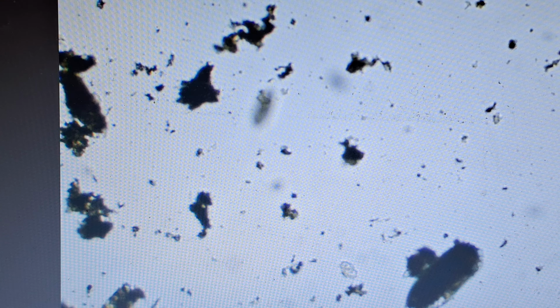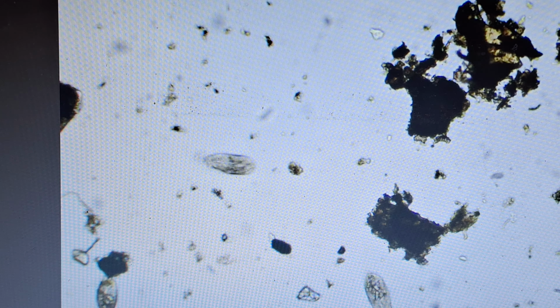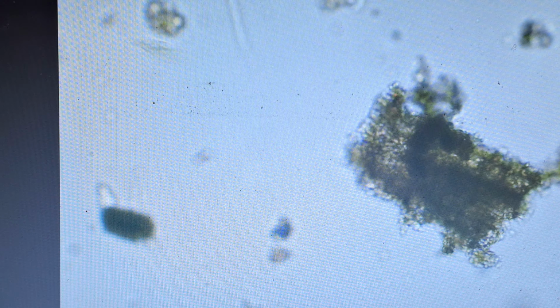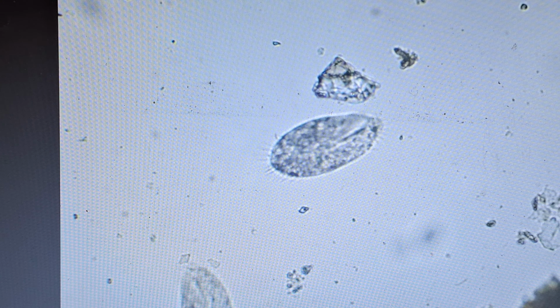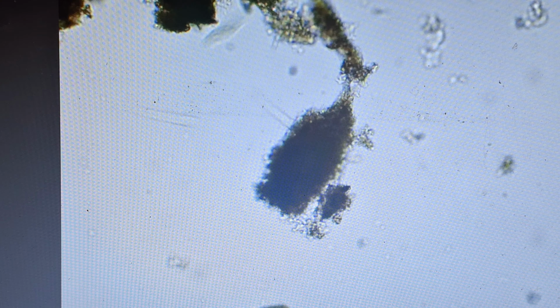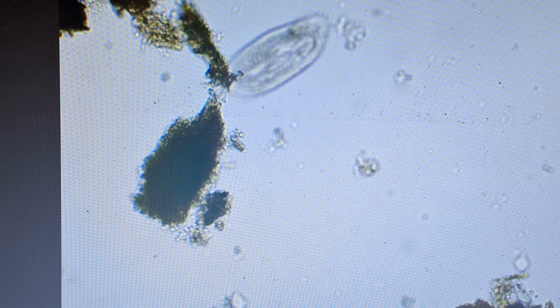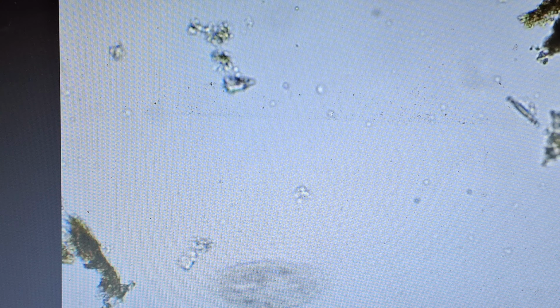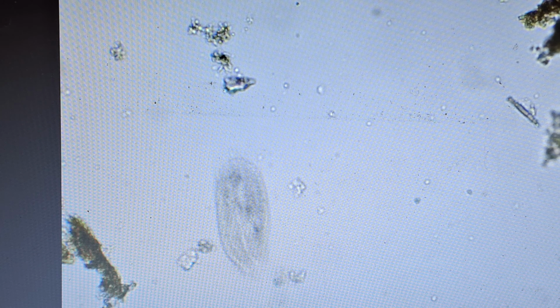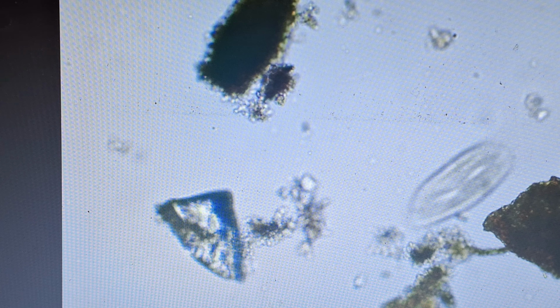Oh, there's one there. There we are. So all these ciliates are a sign of a low oxygen environment. We're going to zoom in, see if we can see one of these close up. We'll see all the hairs on their body, cilia. That's how they move around. There's a whole bunch of them. If you see 3 to even 5 per slide, you're okay. But we're seeing that in almost one frame. We're zoomed into 100x here. See them going to work. So that's telling us it's anaerobic.